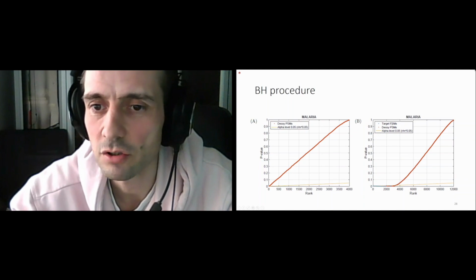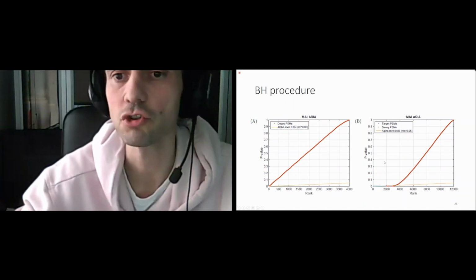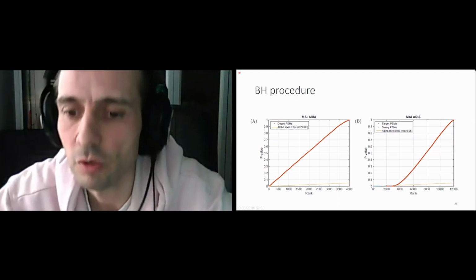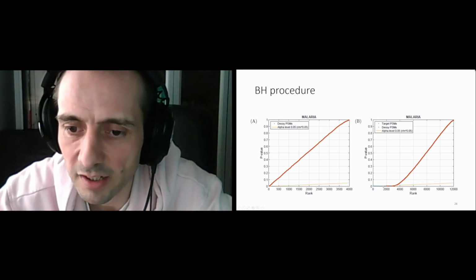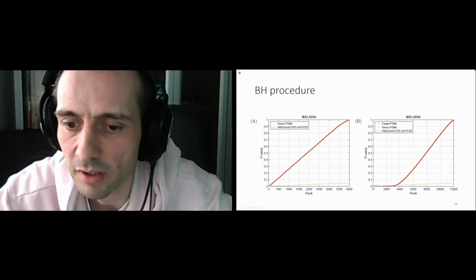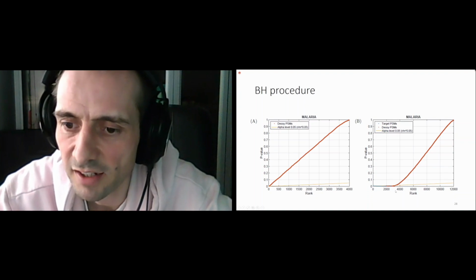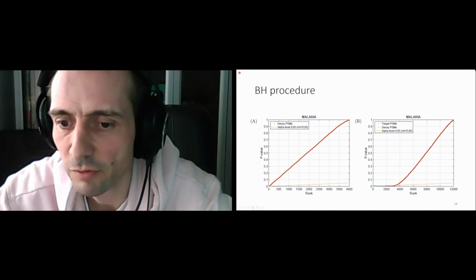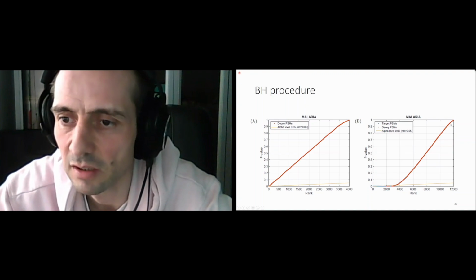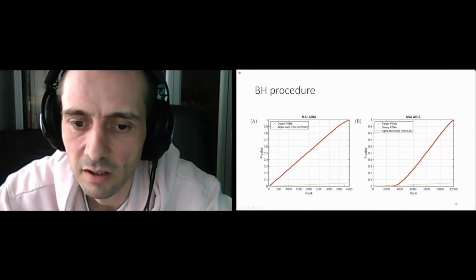I'm just using the target decoy merely for illustration, so that you can see that here indeed the target peptides are ranked at the very beginning, and they have very small, teeny tiny p-values. And then the decoys, which are coming from the null distribution, are more or less uniformly distributed.